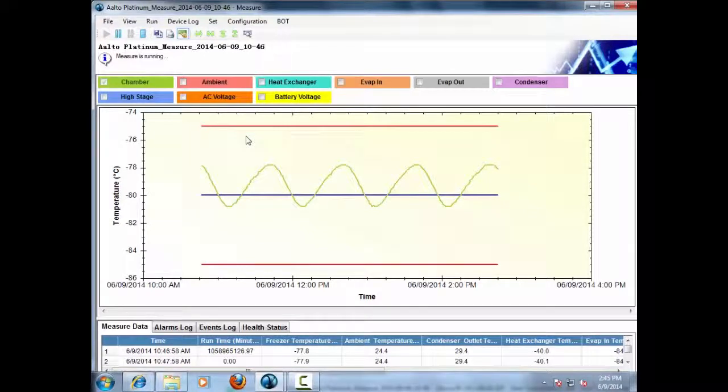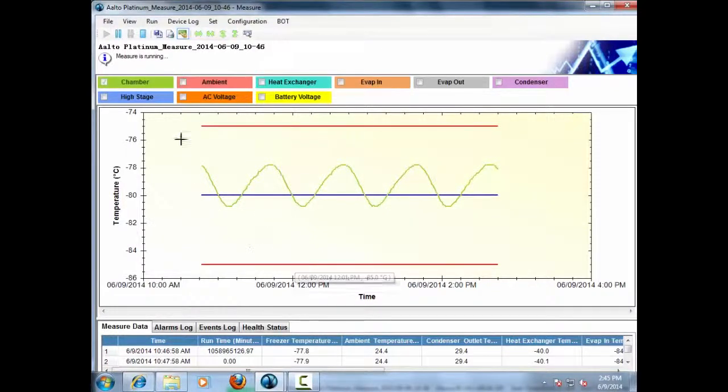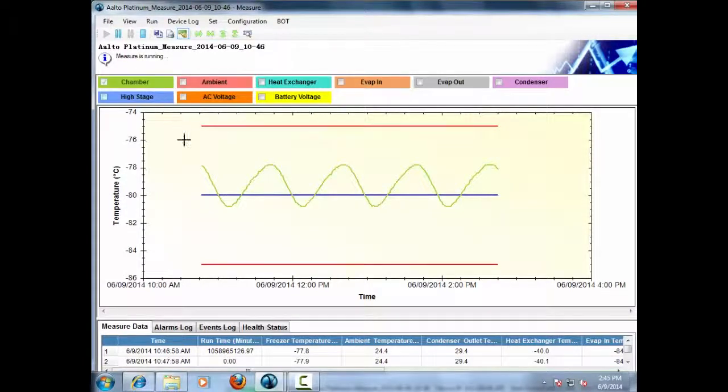Here, the Voyager continuously acquires sensor data from the Alto freezer at a periodic interval and plots the data on the graph as shown on the screen.